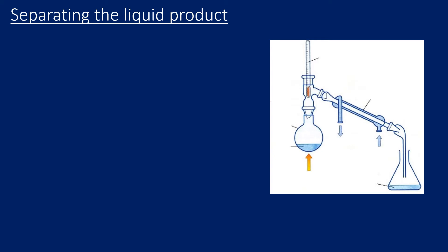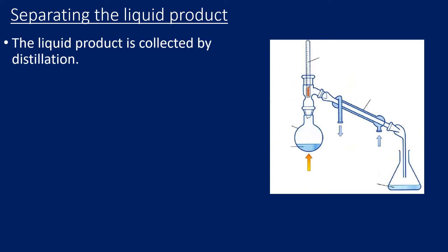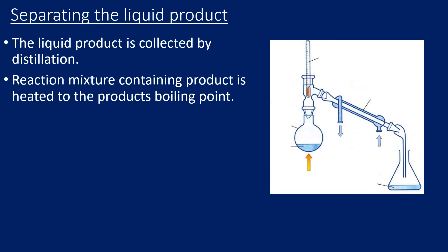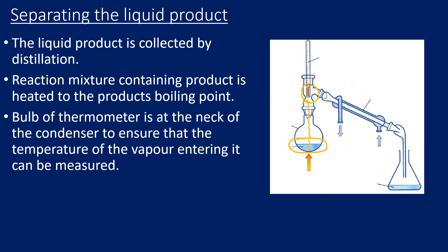The next stage is to isolate our crude product using simple distillation. We take our reaction mixture, which contains all the products and any unreacted reactants, and heat it above the boiling point of our product so it begins to evaporate. Notice how the bulb of the thermometer is at the opening of the condenser, which is sealed so vapors can't escape. The product enters the condenser, cools, condenses, and we collect our crude product. Water goes in at the bottom of the condenser and out at the top — always against gravity — to ensure there are no air bubbles.